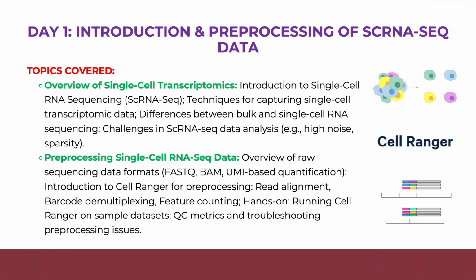Day one is about introduction to single-cell data. On day one, we will set the foundation and you will learn how to access and explore the public cell datasets. You will understand the data formats and how to prepare your data for further analysis. Get hands-on quality control, normalization and pre-processing using popular tools and open source platforms.